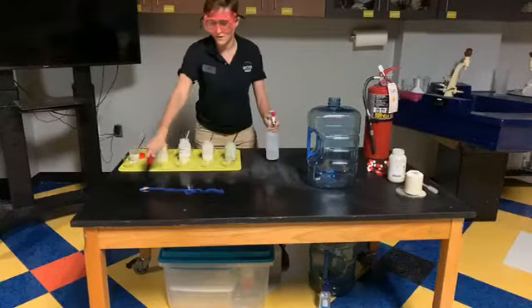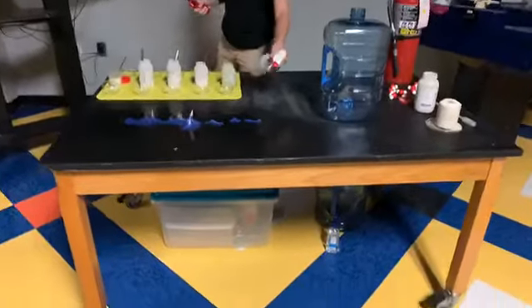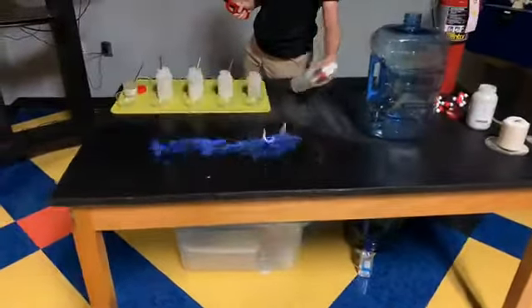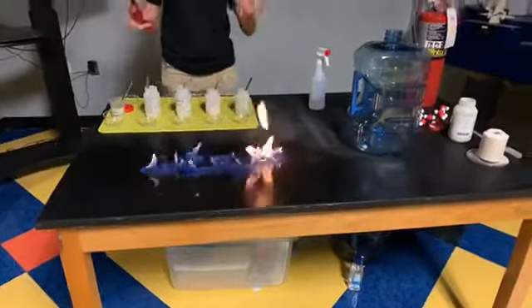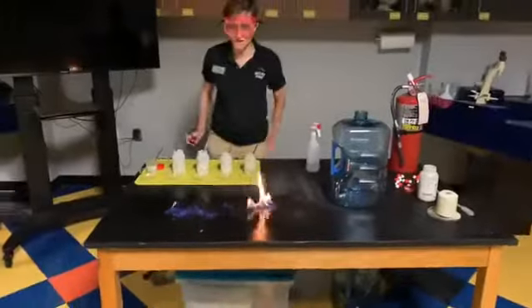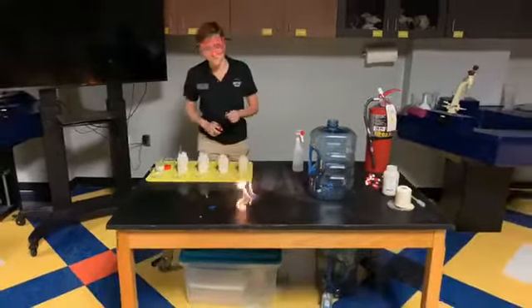Get that going there. These are our special lab tables that we have here in our steam lab, and they are designed to withstand everything from fire to explosions to chemical reactions and everything else. And at the end, we'll show you a couple other cool things about our lab.